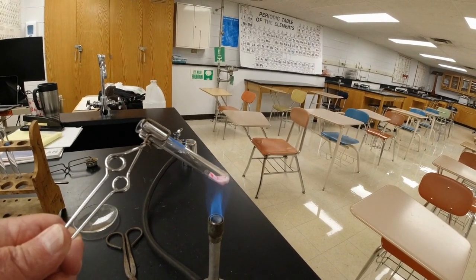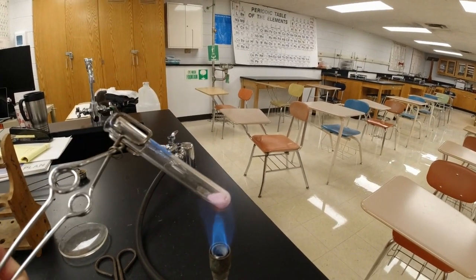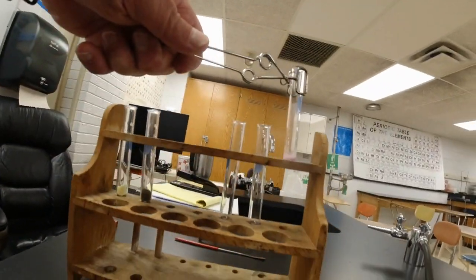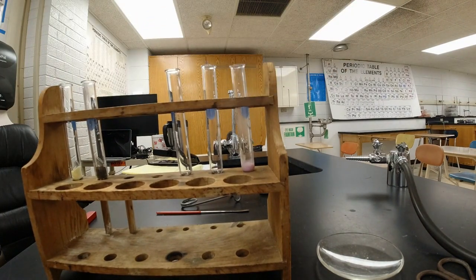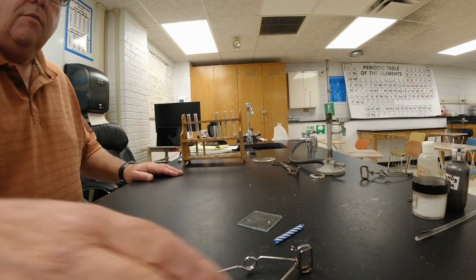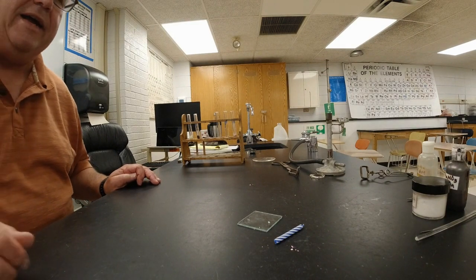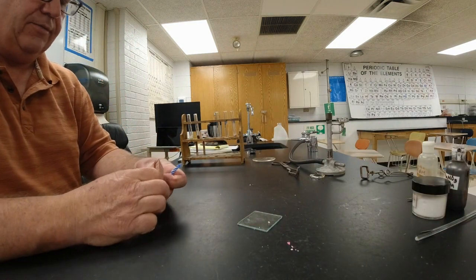The chunk of wax in there is changing shape, and it's becoming more and more liquid. I don't know if you can see that real plain, but now it's completely liquid. All right, it's completely liquid now. I'm going to set this back in the test tube holder here, and we're going to let that rest for a little bit, and I'm going to turn off the Bunsen burner. All right, back to here, and then we're going to light a candle. We already did that candle lab, so we should be pretty good at this.